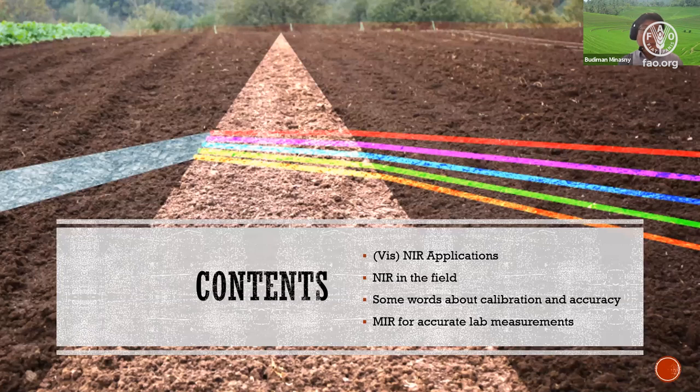The structure of this webinar is that I'll be very general. I'll give you an overview of visible and NIR applications. Continuing from last week, where Dr. Bostenberg presented about some of the near infrared, I'll continue with near infrared applications in soil science, and then how it's going to be used in the field.